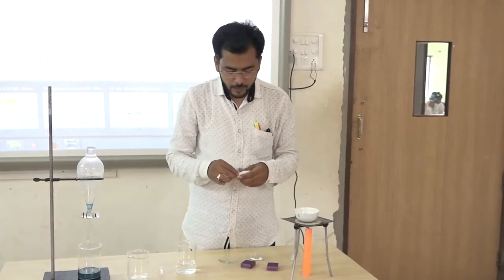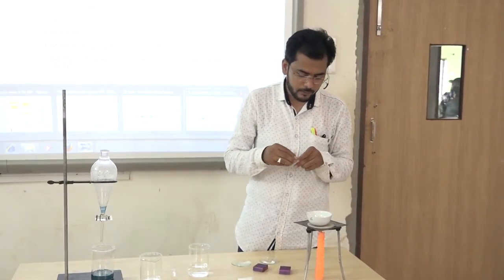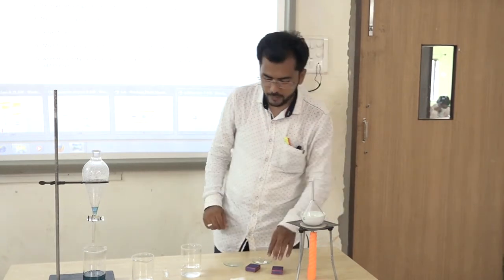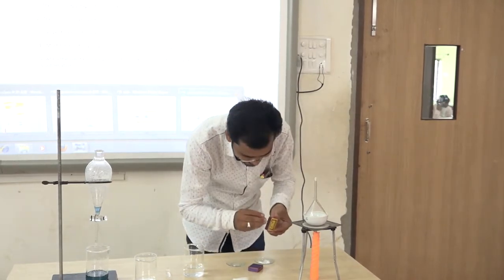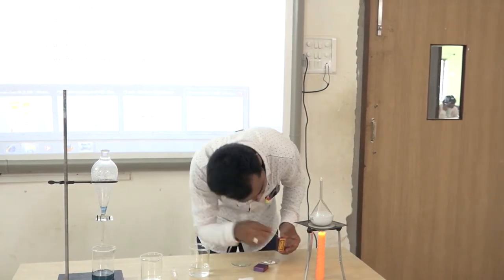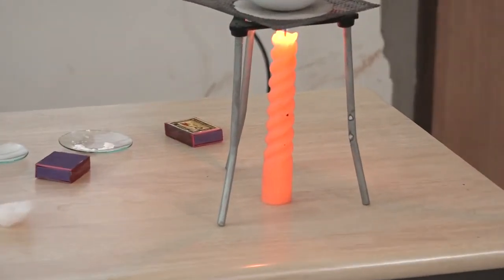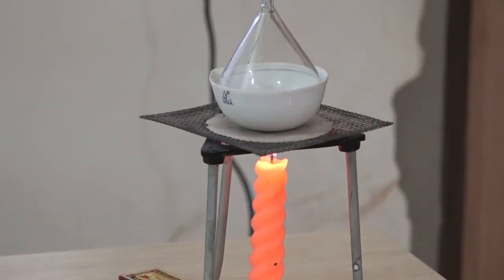After mixing, we have to keep an inverted funnel on top of the china dish, covering it. And after that we have to light it. Fire it. What happens actually, the principle used here is that one substance is going to sublime and another one is going to remain in the china dish.